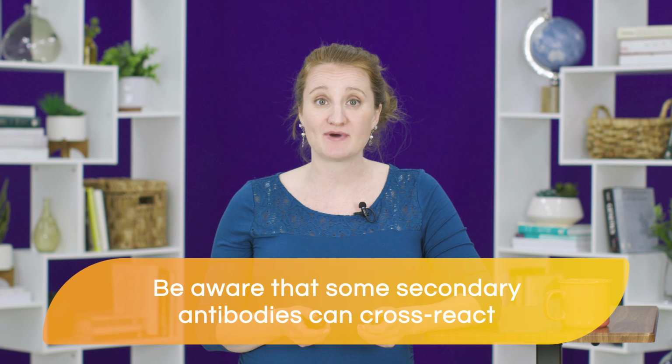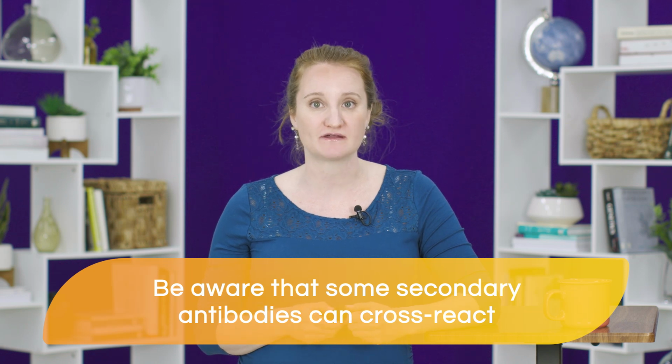Multiplexing is not limited to only two targets. You can probe for more than two targets as long as you can validate the primary antibody for proteins of distinct molecular weight. Multiplexing is a great feature of the NIR Western blot, but be aware that some secondary antibodies can cross-react with each other. To prevent this cross-reactivity, secondary antibodies can be further purified via cross-adsorption.